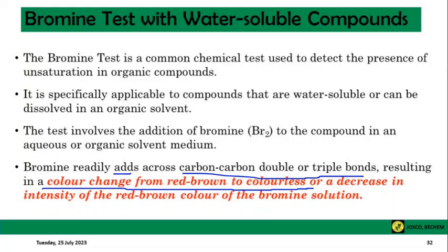Once that happens, we are saying that decolorization has occurred. I hope you get the concept. Very good.